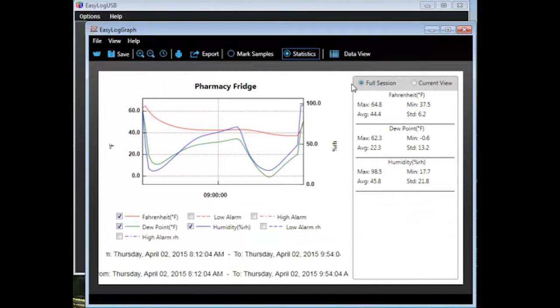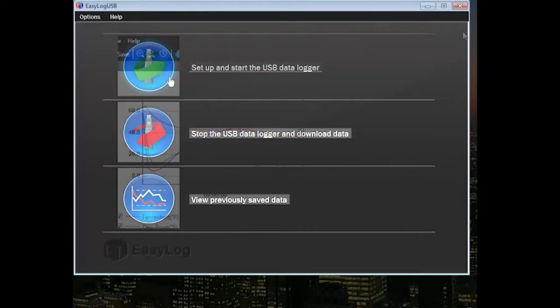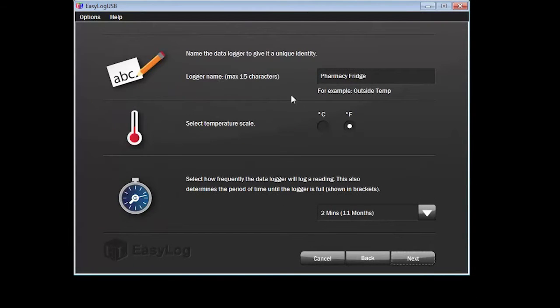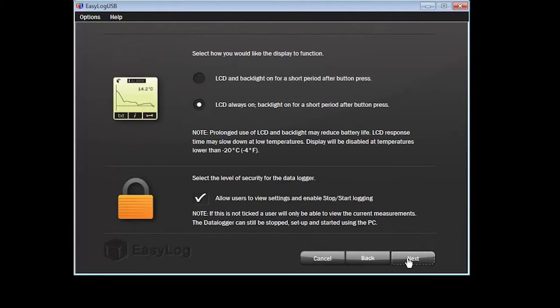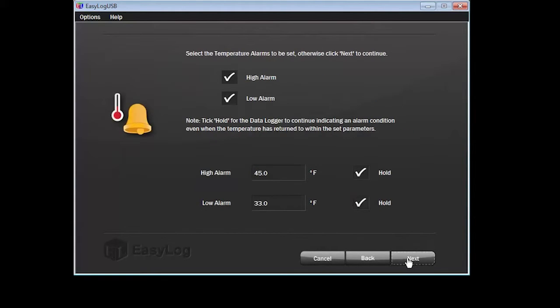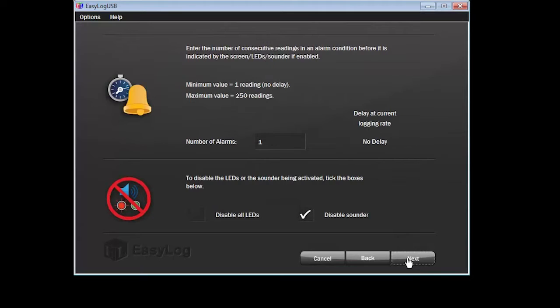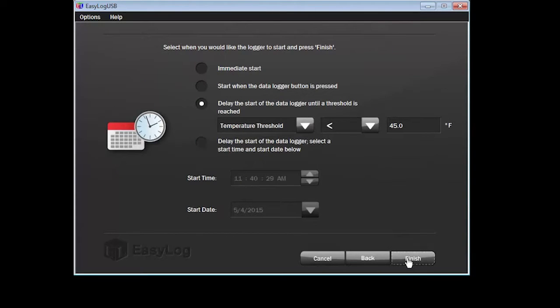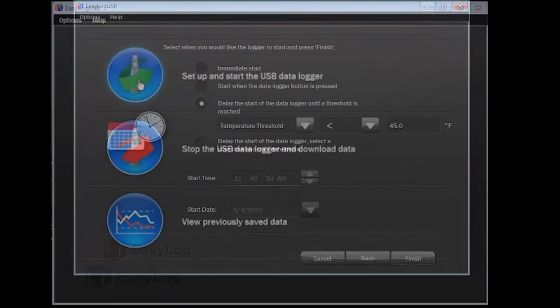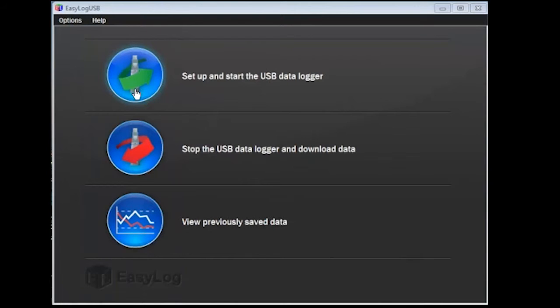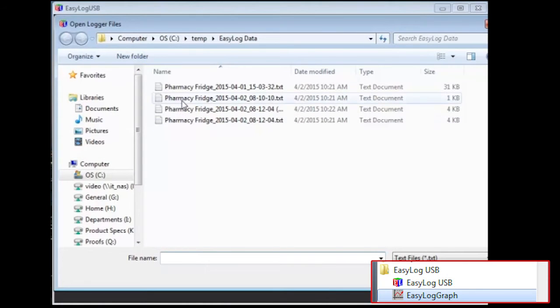It is important to remember that the device was stopped prior to downloading the data. Before you can use the data logger again, you will need to rerun the Setup and Start the Data Logger option. You should not need to change any values except the delay start option. You can start the logging immediately from the device, but the data logger will likely go into an alarm mode — this can be an issue if you selected the hold option when setting the alarm conditions. You can view previously saved data at any time by selecting the appropriate option from the menu, and you can also launch Easy Log Graph from your Windows menu.